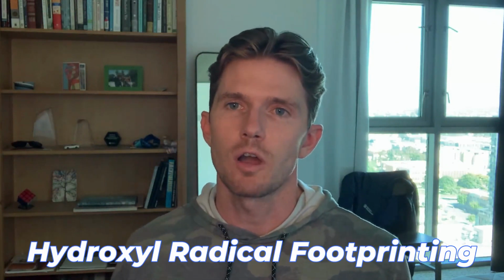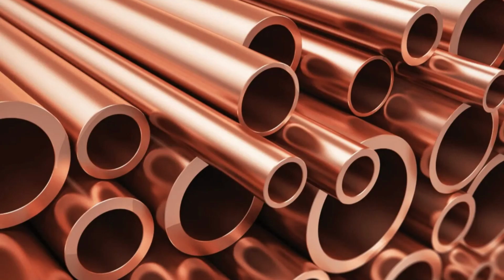DMS is able to get a more precise binding sequence because it's able to cleave closer to that protein than the DNase enzyme would. Dimethyl sulfate will methylate bases, and then after treatment with piperidine, the base will be removed to form an abasic site. And then piperidine will also allow for the cleavage at that site. Another way to break strands of DNA for this assay would be to use hydroxyl radical footprinting. Here you use organometallics with iron or copper to generate radicals that can break DNA strands.